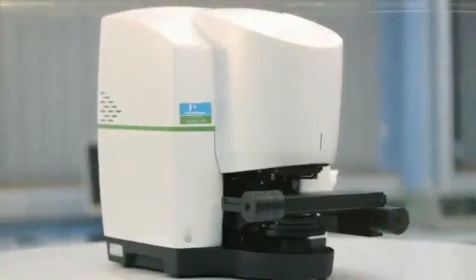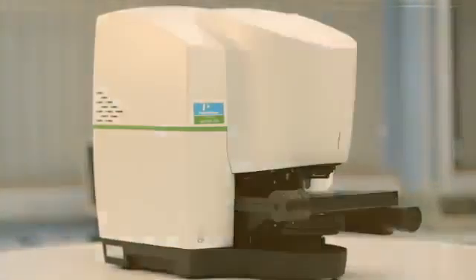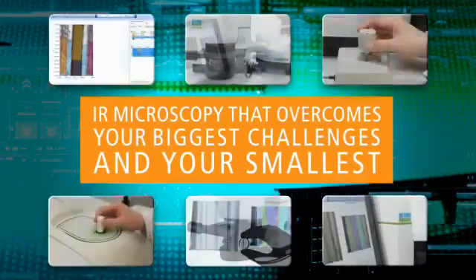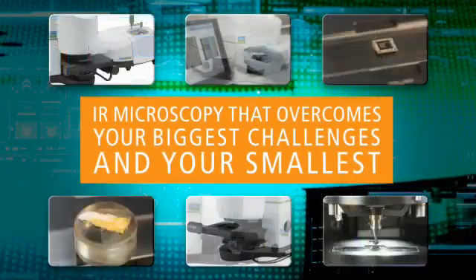Welcome to the new PerkinElmer Infrared Microscope Systems, the Spotlight 150i and 200i.